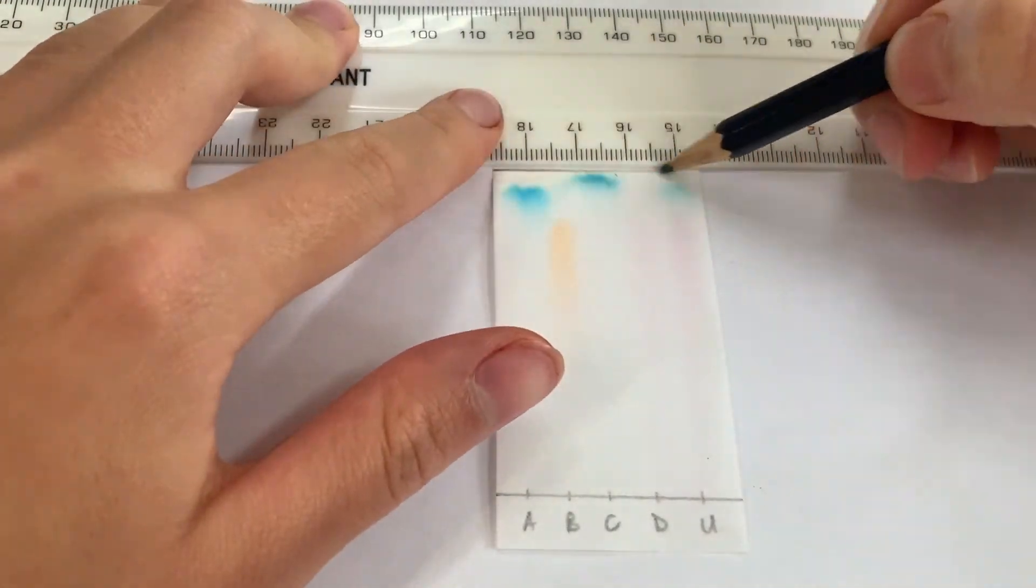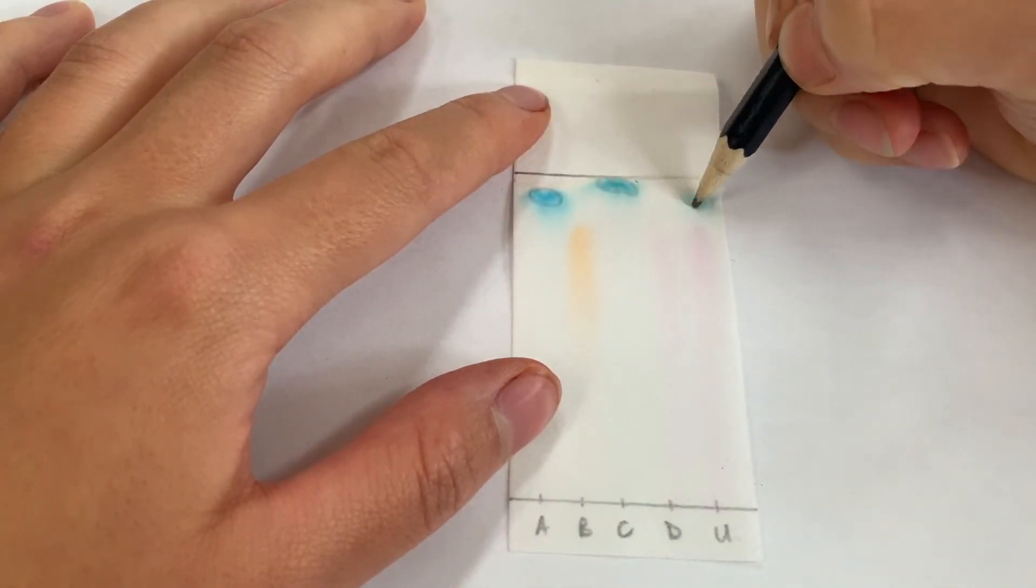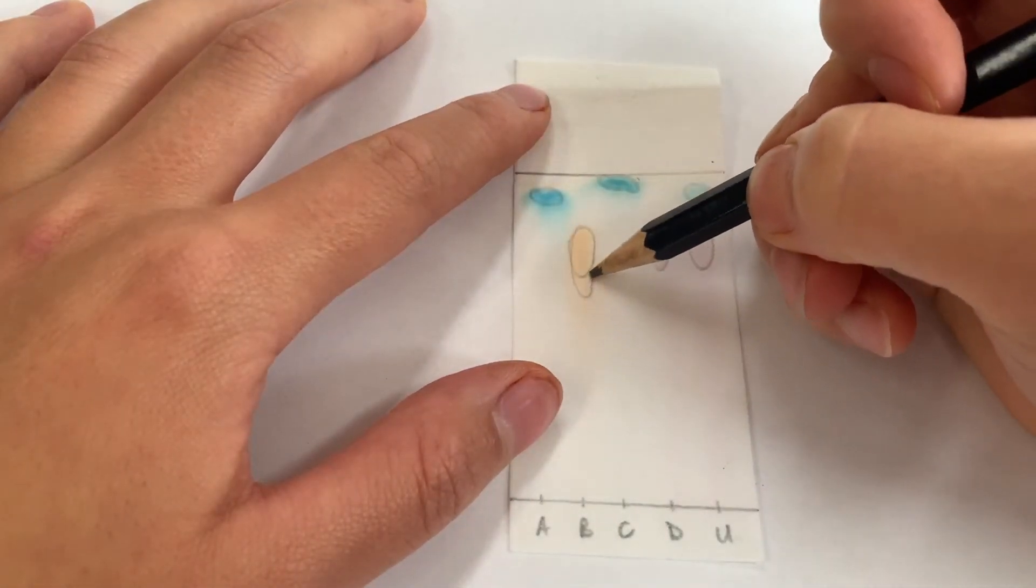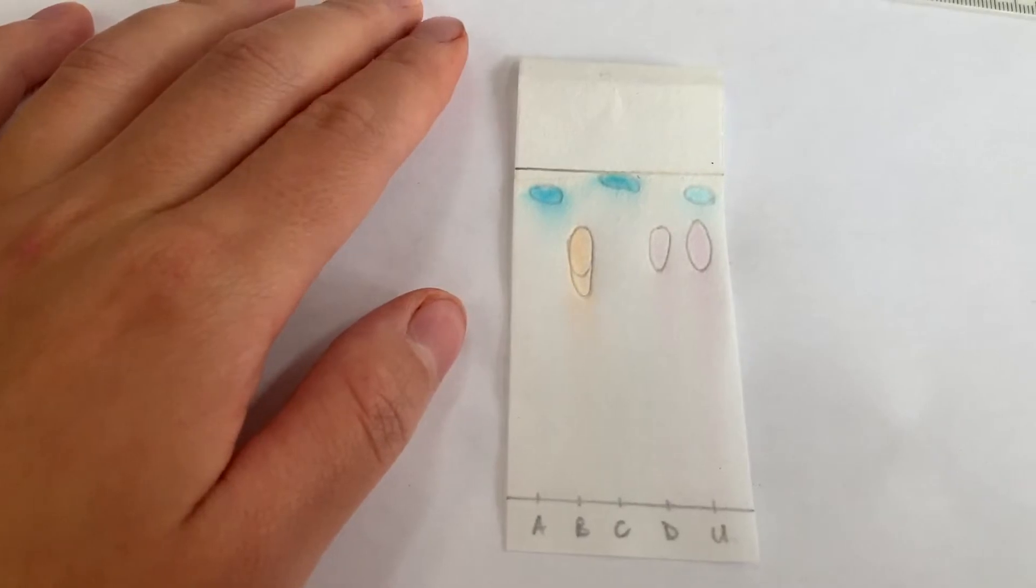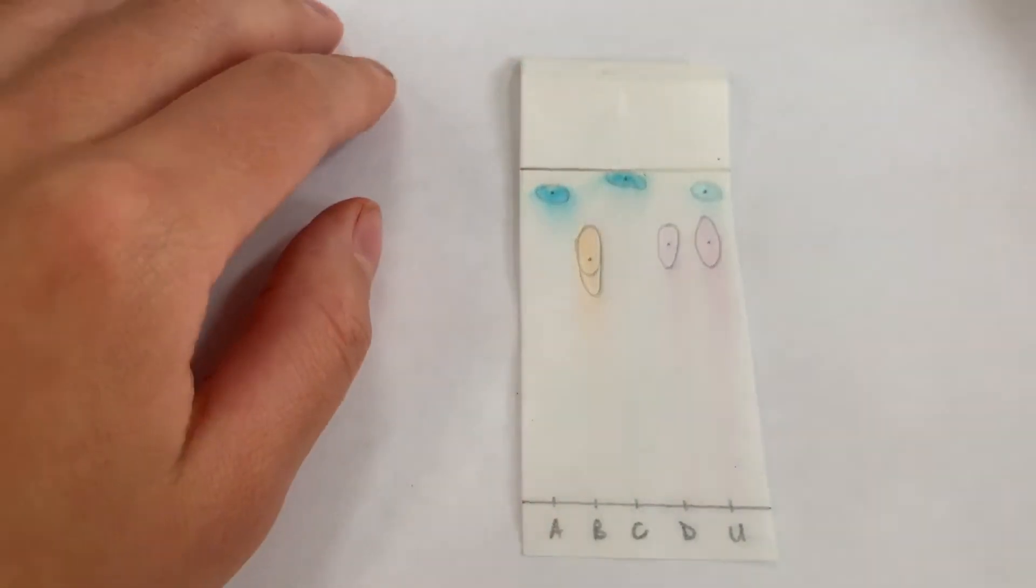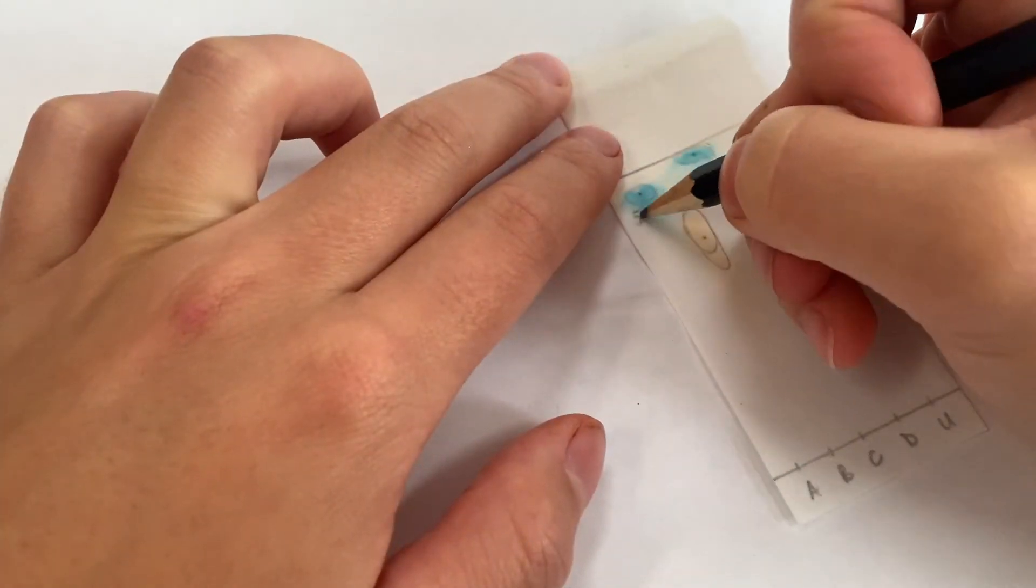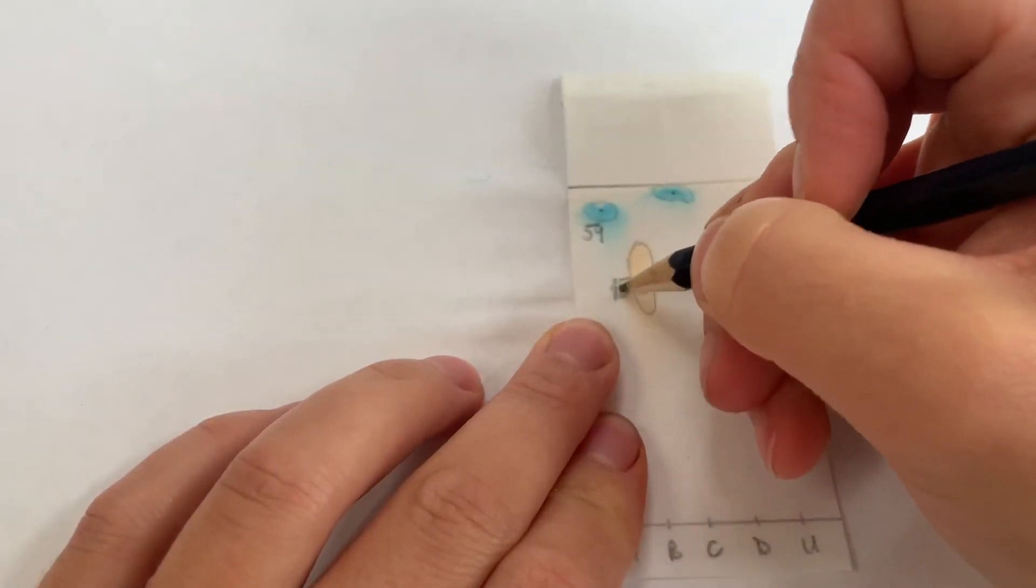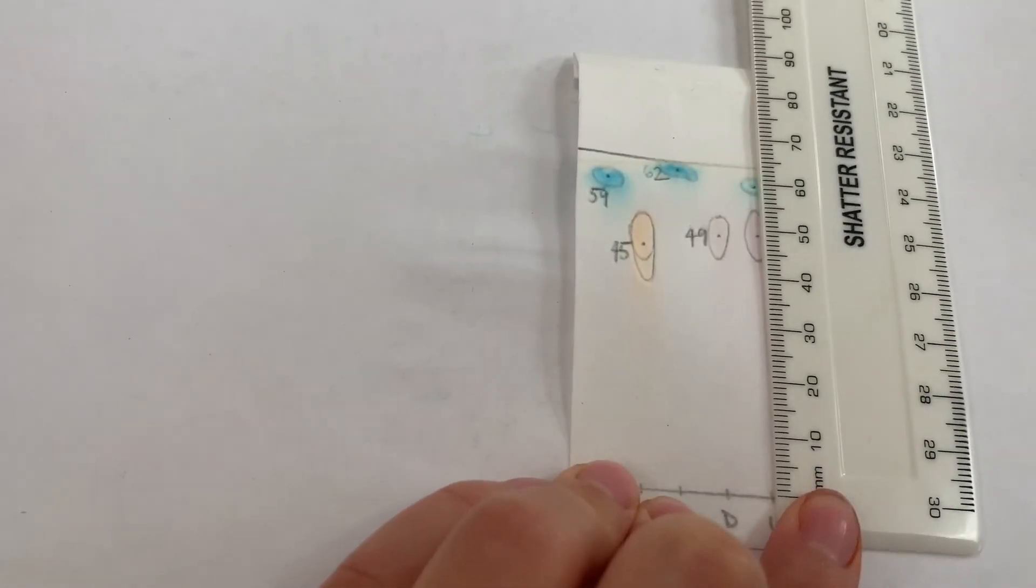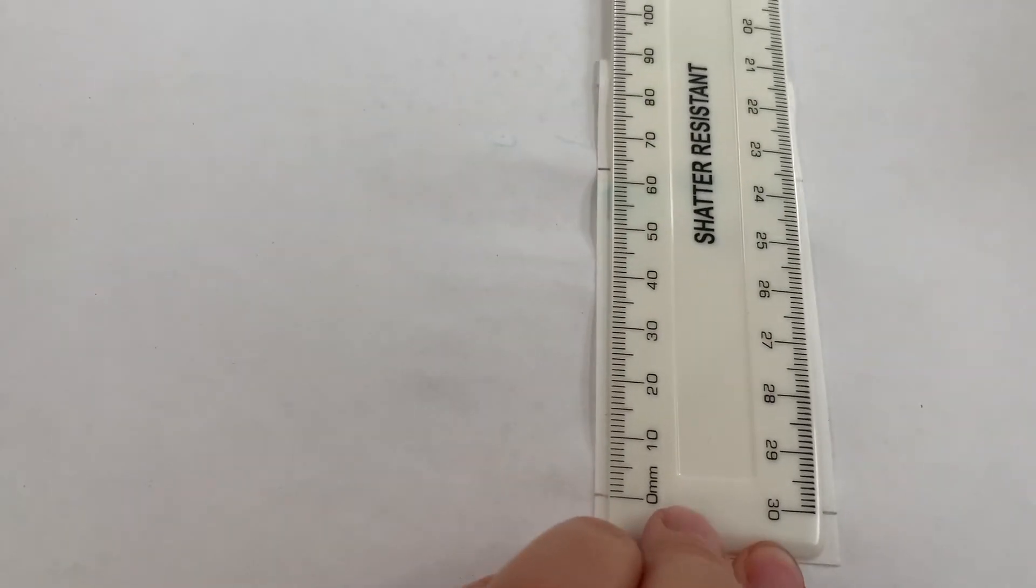Once dry enough to work with draw a line across where the water traveled to. Then draw a circle around each of your compounds and place a dot in the middle of them. Measure the distance from the starting line to each of these dots and then finally measure the distance between the starting line and the solvent front.